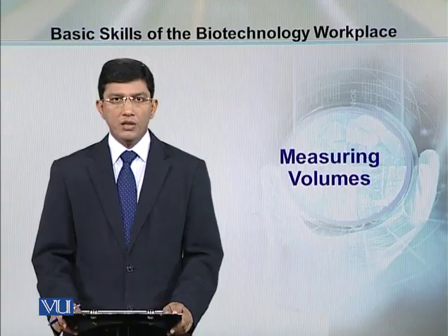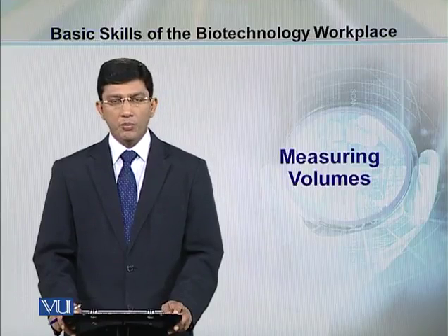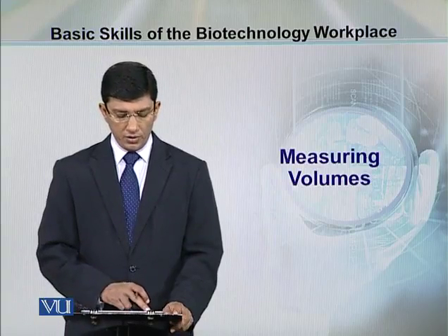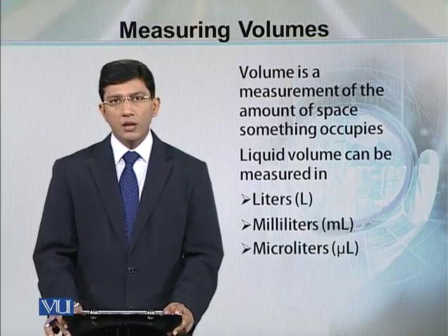सकती है। So in this module we are going to see what kind of equipment and what kind of glassware is available to prepare the solutions. And for solution preparation, we need to measure the volumes.